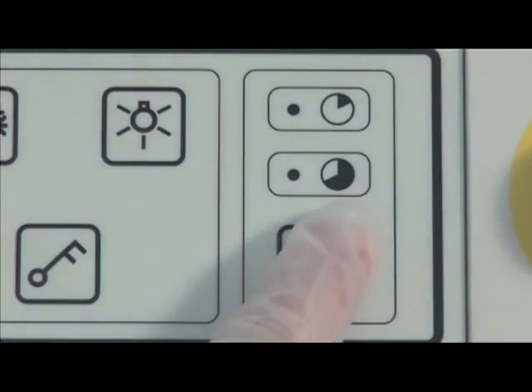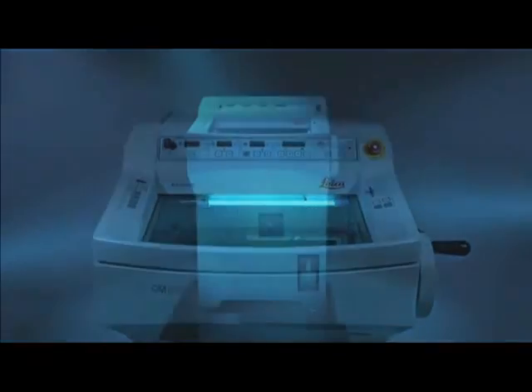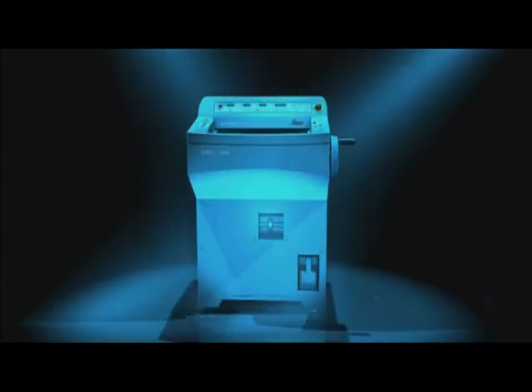The UV-C disinfection system of the new Leica CM-1950 is activated. This significantly reduces the risk of infection due to bacteria, viruses, and fungi during cryo-sectioning.